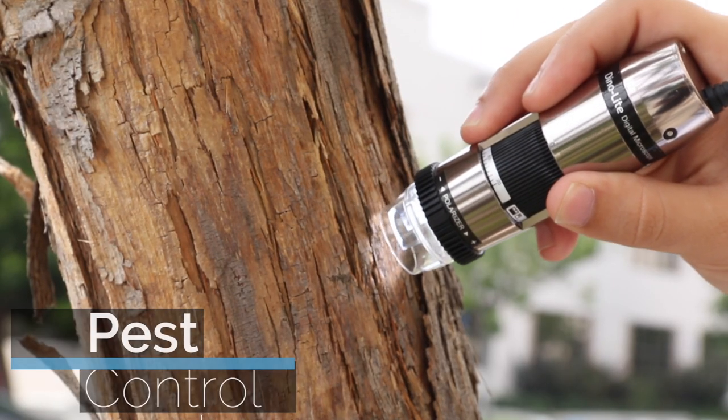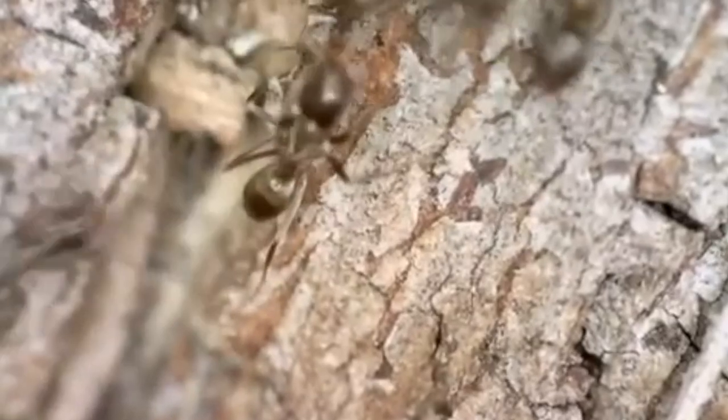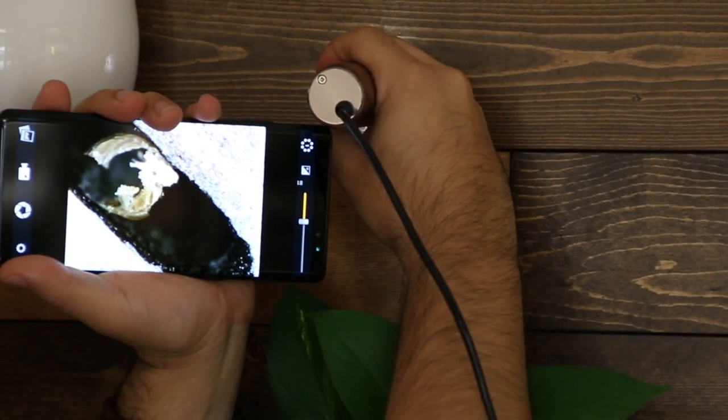Dynolite microscopes are easy to use and portable, providing powerful magnification features on the go for insect identification.